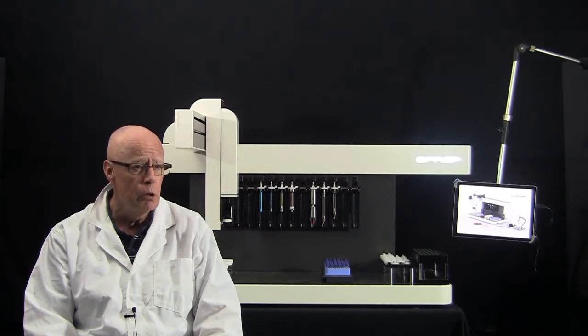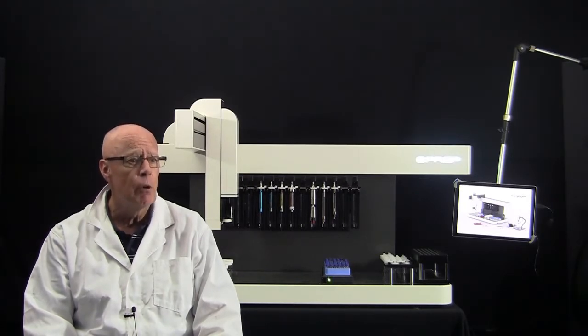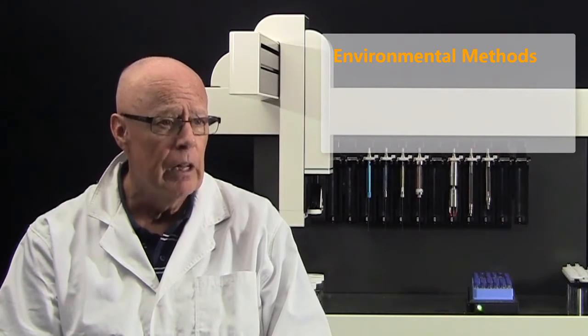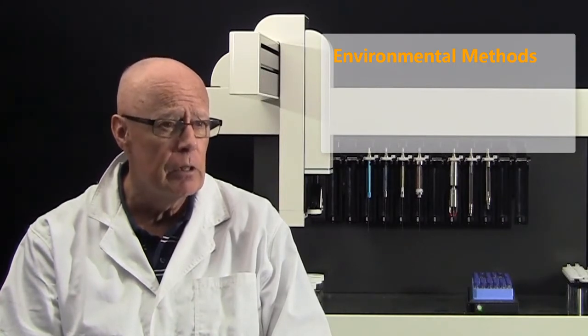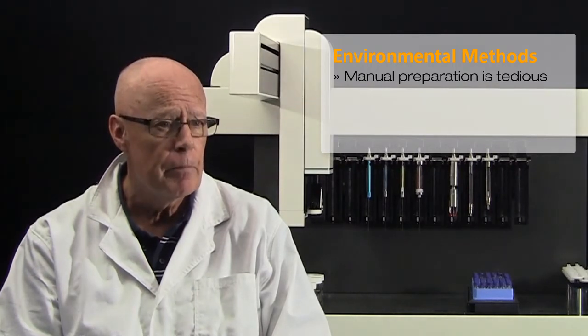The approach that you will learn in this demonstration to automate a method can be used for a wide range of applications, for example, labour-intensive environmental methods. There are many environmental methods based on US EPA methods used throughout the world, and the protocols of these methods are tedious for both sample and standard preparation.